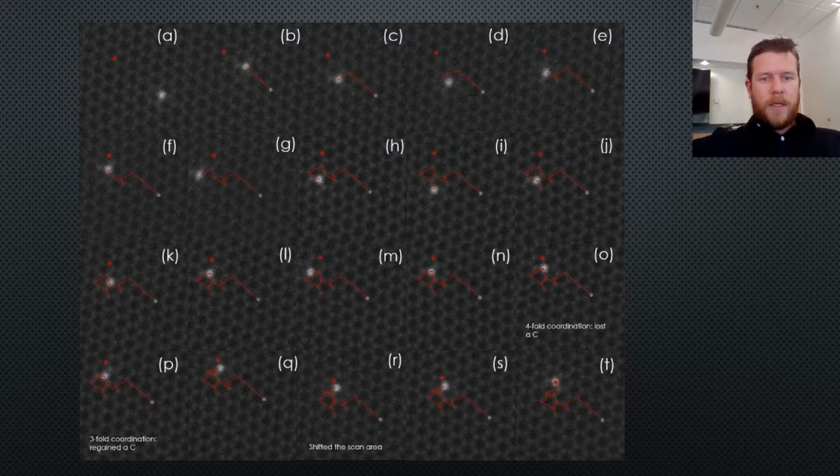So then we can begin to try and actually move the silicon atom to a particular lattice site that we want. So this was our first attempt at that. So here's the initial position of the silicon atom, and I arbitrarily decided I wanted to get it to this lattice site. And the little gray dot represents the initial position, and the red line represents its movement through time.